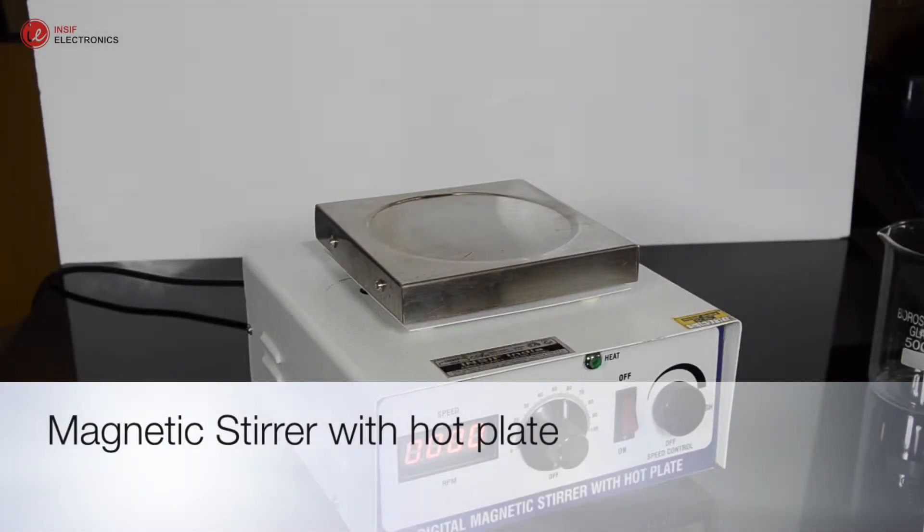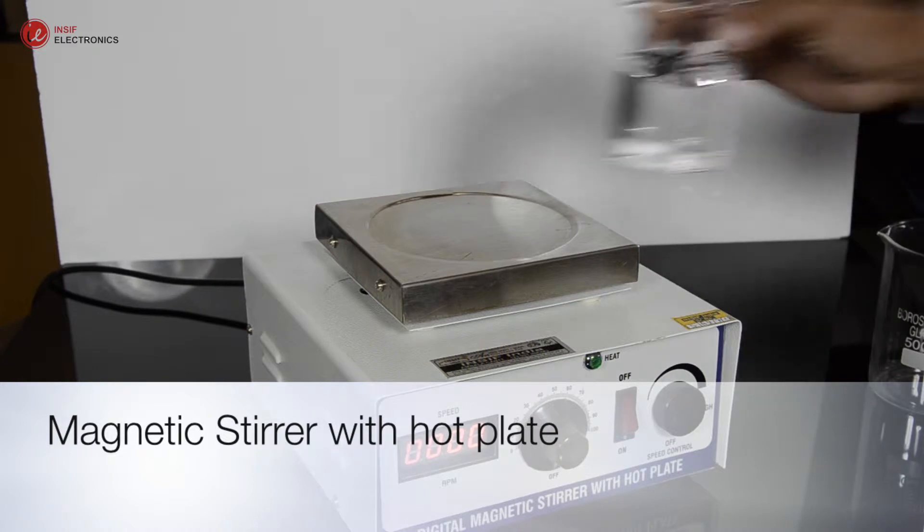Magnetic stirrer with hot plate is used to uniformly heat the liquid with stirring feature.